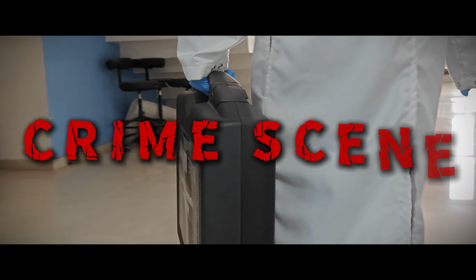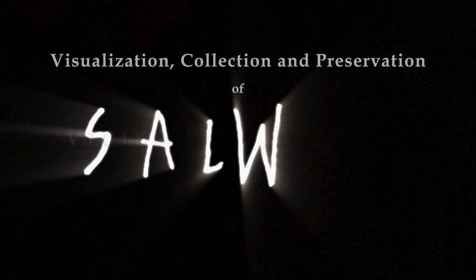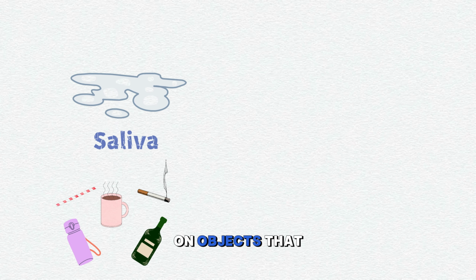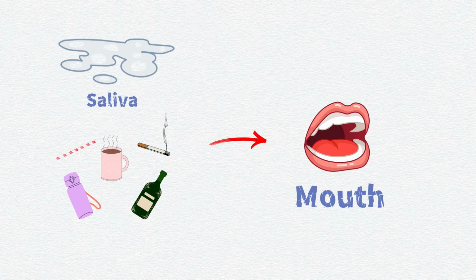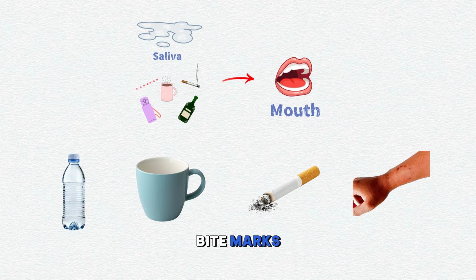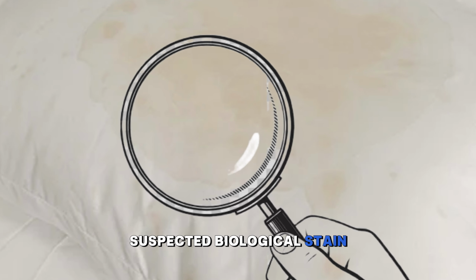One of the most common biological evidences found at a crime scene. In this demonstration, we bring to you saliva, which is often deposited on objects that come in contact with the mouth, like bottle cups, cigarette stubs, or even skin in the form of bite marks. The first step is identifying these suspected biological stain areas.